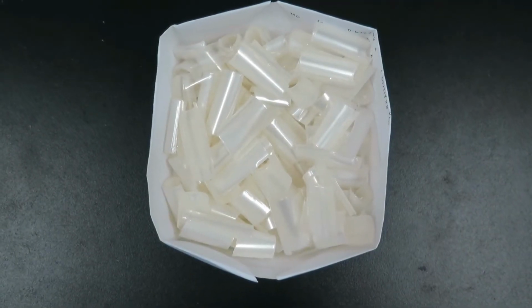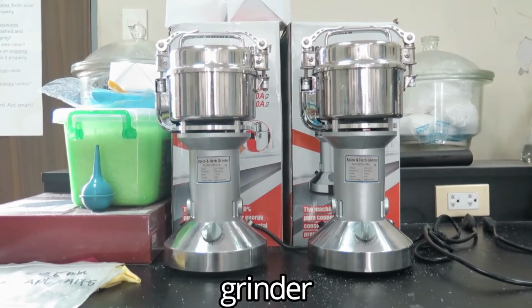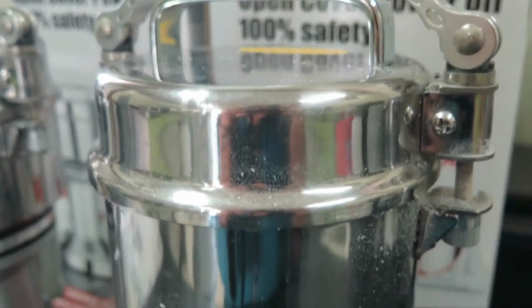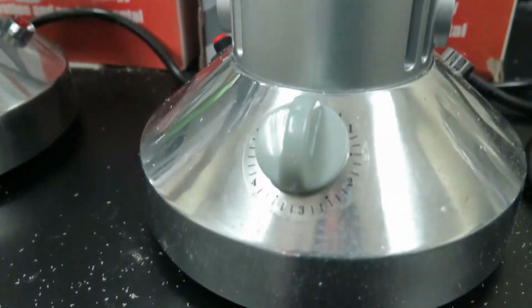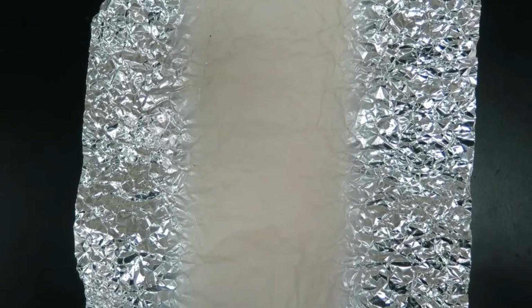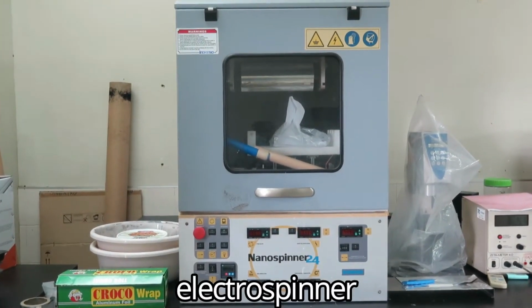For example, if you want to turn this to this, we have the grinder for you. But what if you want to make a nanofiber mat from a polymer solution using voltage? Don't worry, you have the electrospinner.